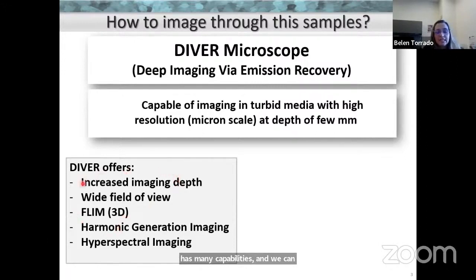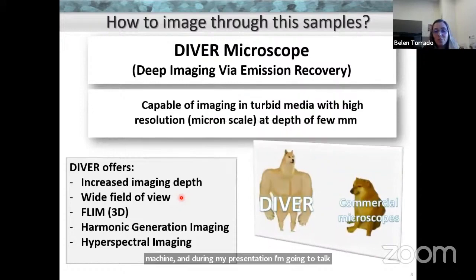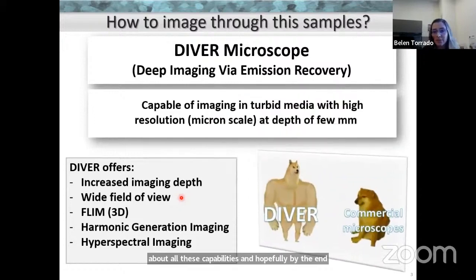The DIVER has many capabilities. We can have increased depth, we can go deep, we can have a wide field of view, we can do FLIM, harmonic generation imaging, and hyperspectral imaging. And during my presentation, I'm going to talk about all these capabilities. And hopefully, by the end of the talk, I can convince you how powerful and strong the DIVER is.